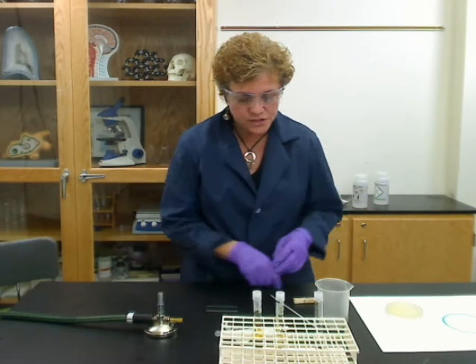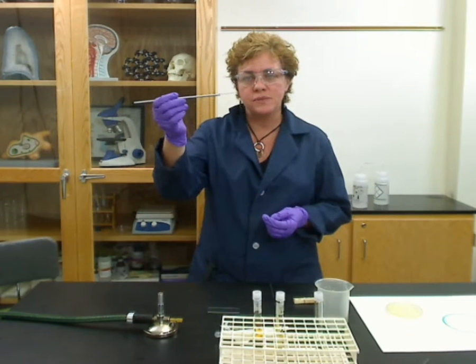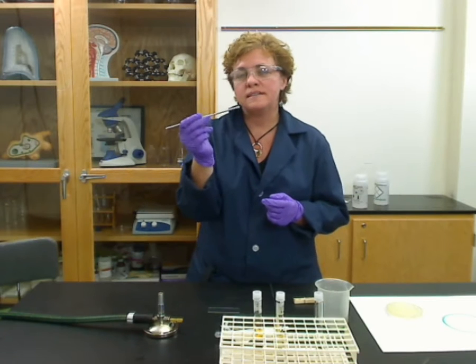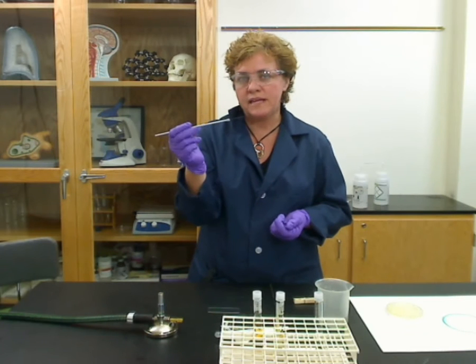The next thing you want to do is get your bacteria into that water and spread it out. You're going to take an inoculation loop, which is made of metal. Sometimes you'll get plastic ones — the plastic ones are disposable and should be individually wrapped so they are already sterile, and you don't have to worry about the flame.